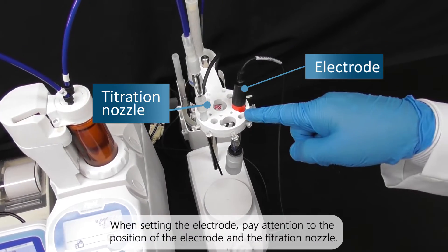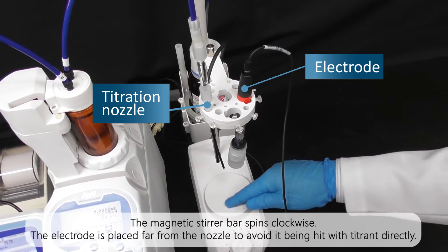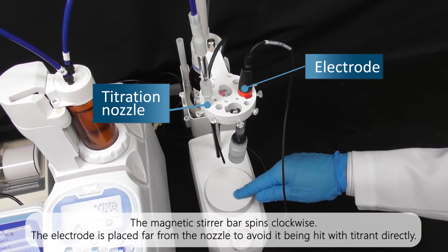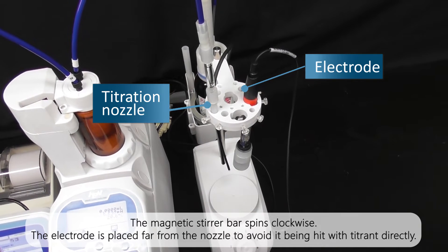When setting the electrode, pay attention to the position of the electrode and the titration nozzle. The magnetic stirrer bar spins clockwise. The electrode is placed far from the nozzle to avoid it being hit with titrant directly.